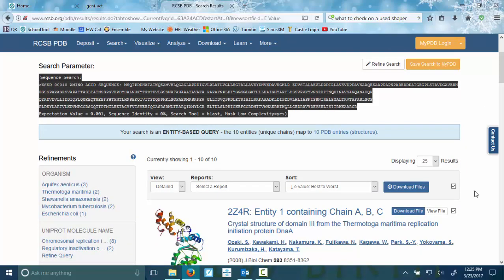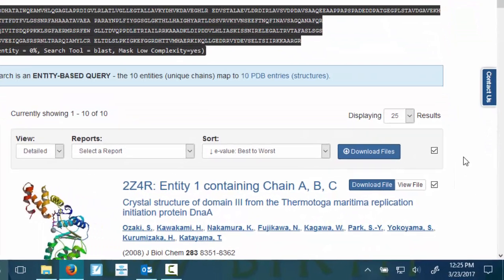So you're going to look at the quality of the alignments between your query gene and your BLAST hits in PDB. And remember that e-value is going to be critical. The 0.001 or less means that it's not likely due to chance. On page 73 of your training manual, it says, if the e-value meets the cutoff set by the instructor and a significant length of the protein is aligned, then it's a good hit.